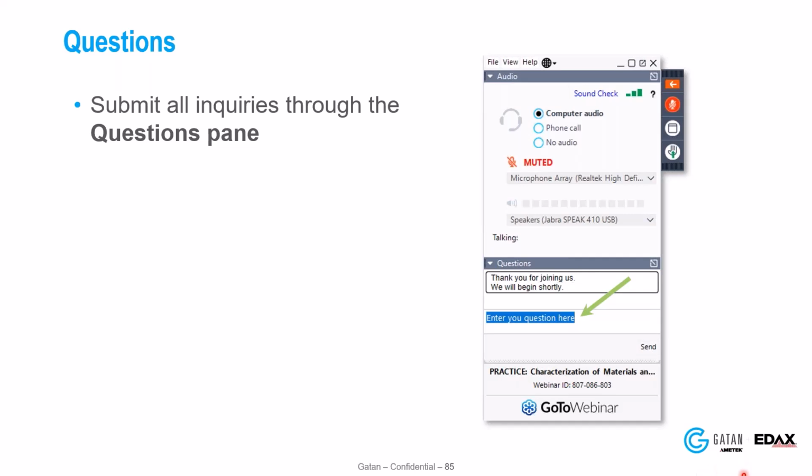So the question is, does the current implementation work for TKD data sets? The answer is yes. And I think we're a little surprised by it because it wasn't necessarily intentional, but it's worked well. I don't have a slide in the presentation, but basically it's just taking that same projection into the experimental space, the sample coordinate space for your TKD geometry.